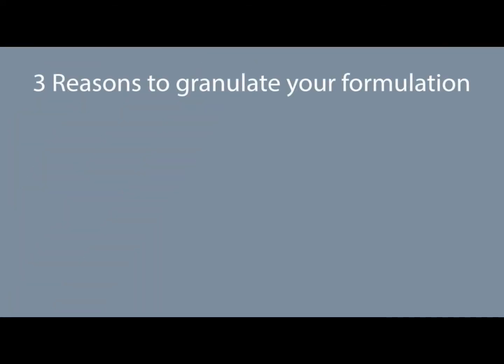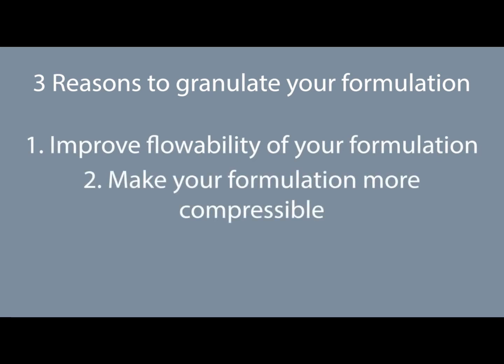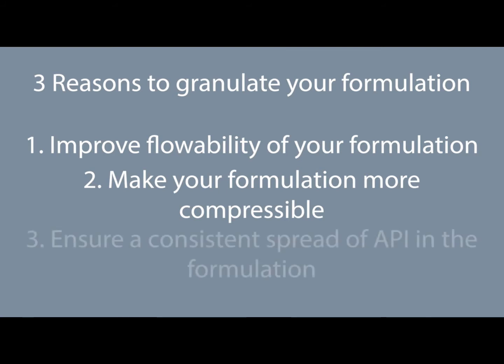There are three reasons to granulate your formulation. 1. To improve the flowability of your formulation. 2. To make your formulation more compressible. And 3. To ensure a consistent spread of API throughout the formulation.